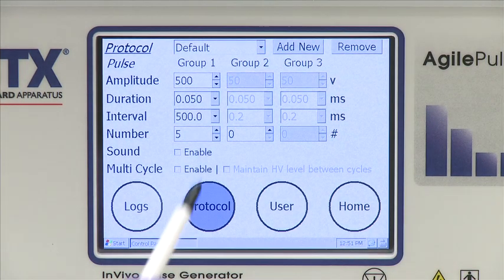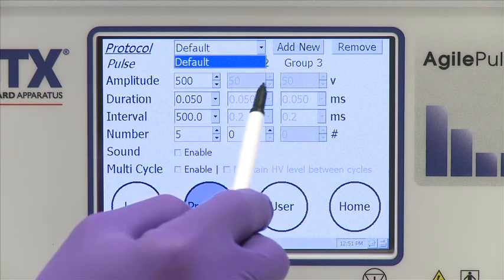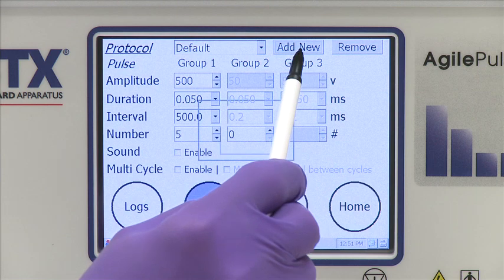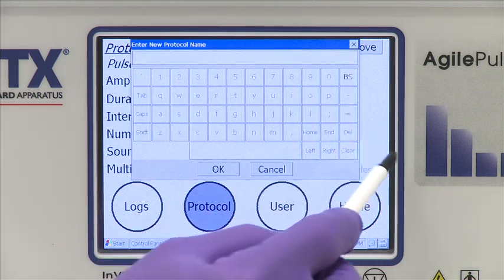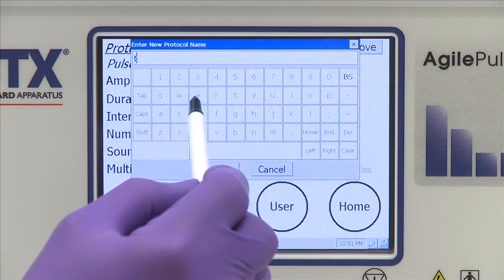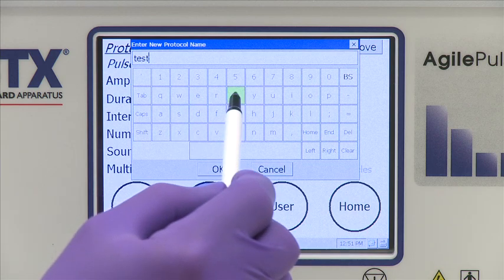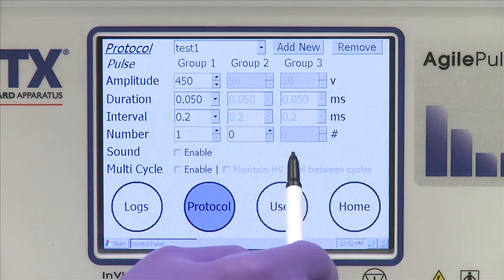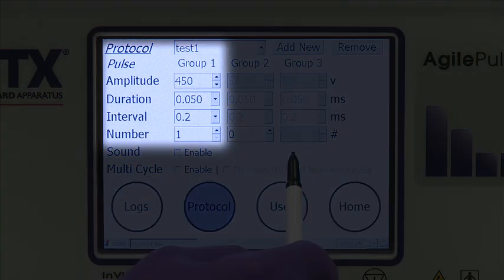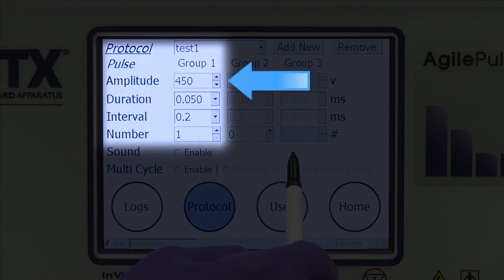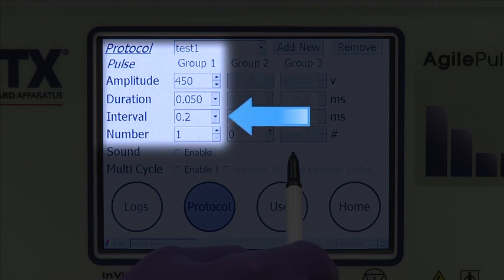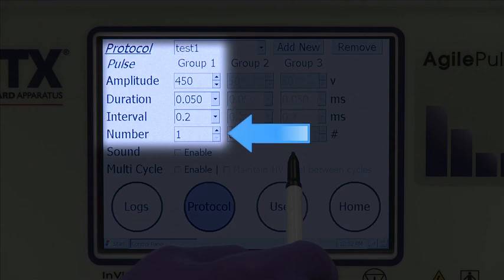To select a protocol, use the drop-down menu at the top of the screen. For this demonstration, click Default, then Add New to program a new protocol. A virtual keypad pops up and allows the user to name the new protocol. To program the parameters, set the voltages for each group. In this demonstration, the voltage in group one is set to 450 volts, a 50 microsecond pulse duration, with a 0.2 millisecond interval, one pulse.